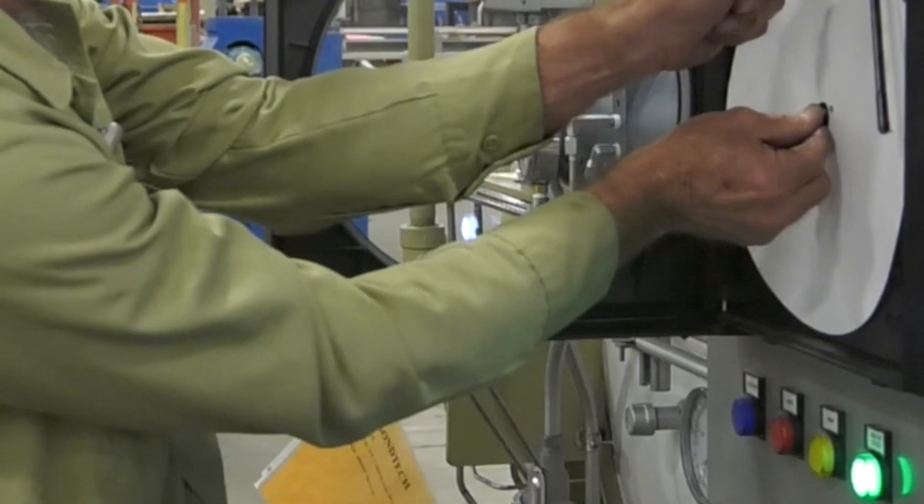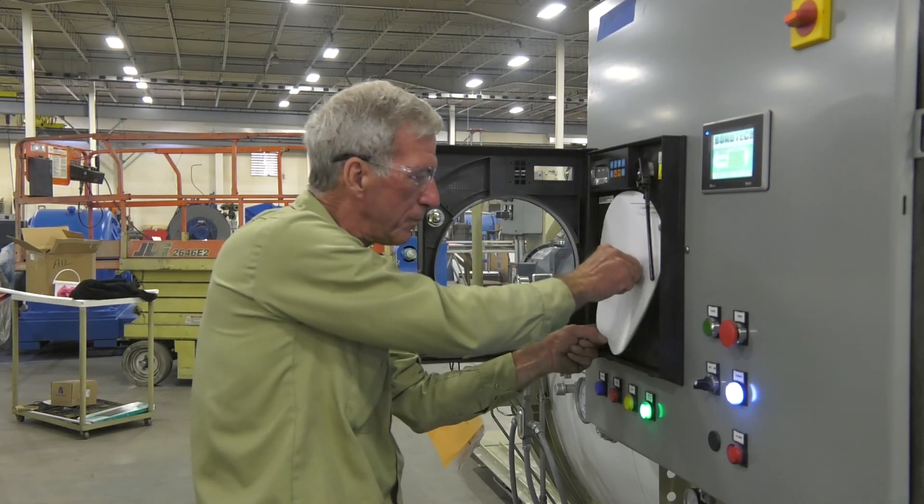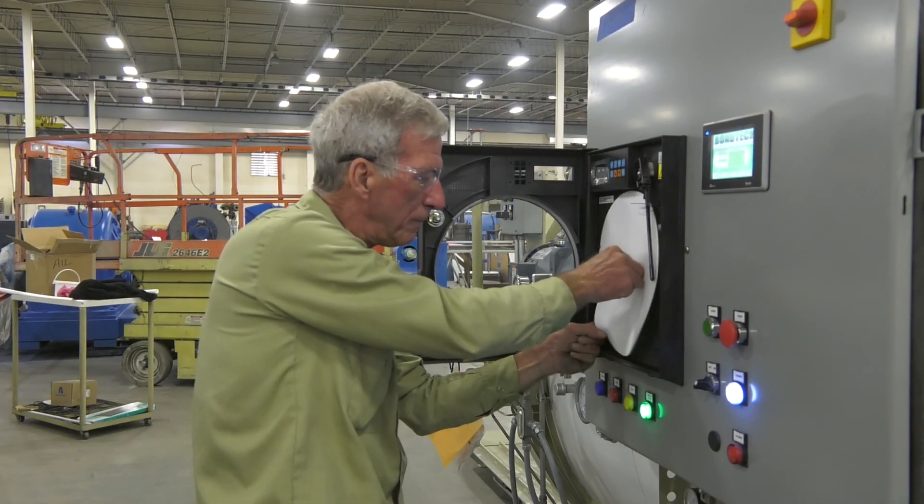Never turn the hub or serious damage may happen. The hub itself is stamped on the face: do not turn hub.